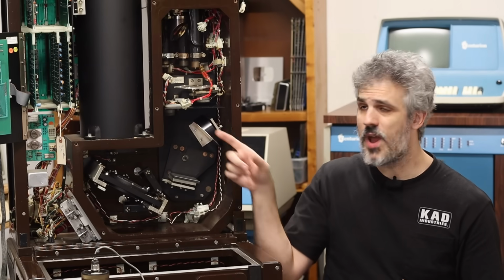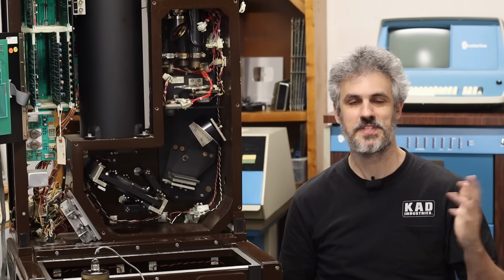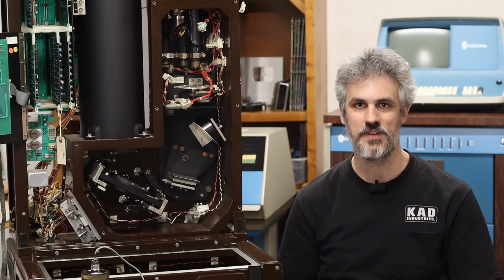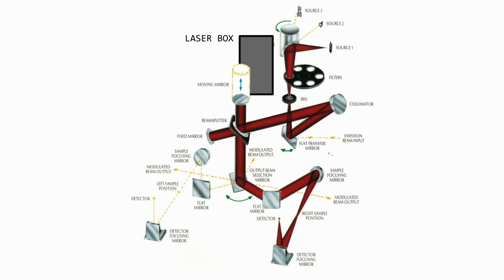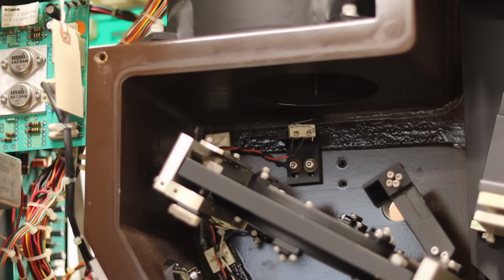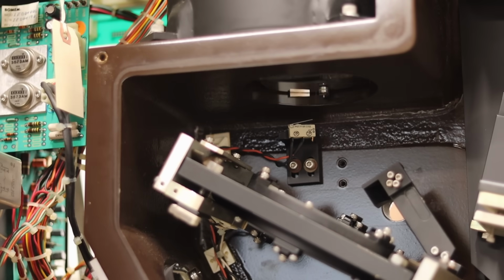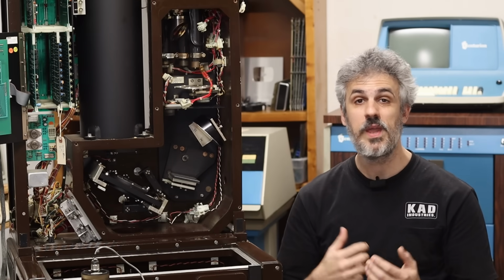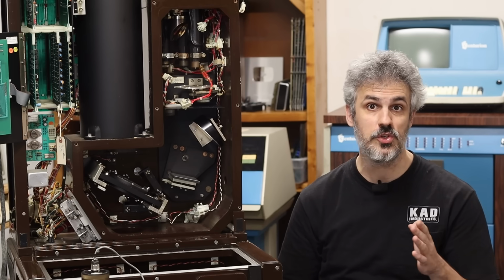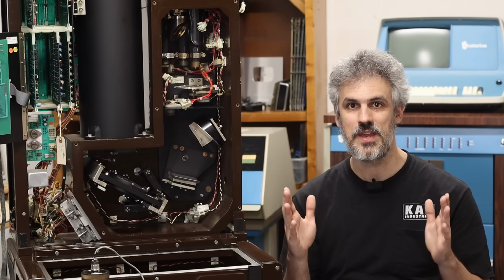Now, if we move this mirror around willy-nilly without really knowing where we started or where we ended up or where it is in relation to the fixed mirror, this doesn't help us at all. It just creates an insane amount of chaos. So what we actually do is we send the helium neon laser through the same path as the collimated beam. So now we can measure exactly how different the two mirror locations are from each other. And if we know that distance precisely, using what we know about the multitude of waveforms that are coming through, we can figure out exactly which waveforms should constructively interfere and which should destructively interfere, and everything in between.